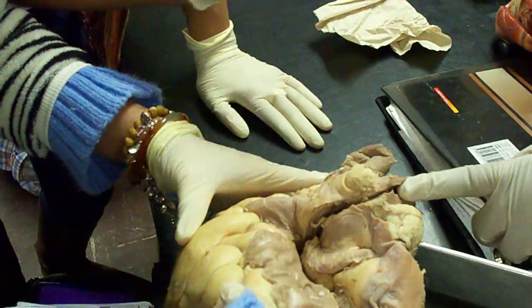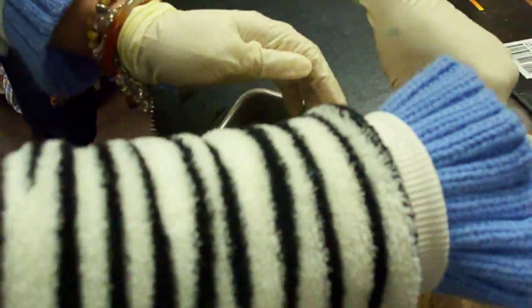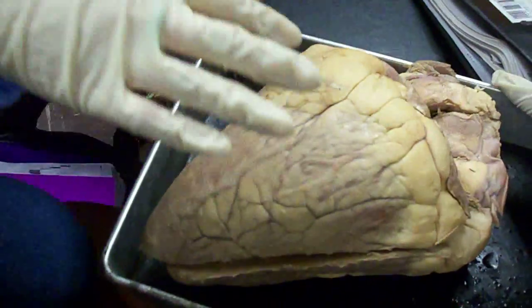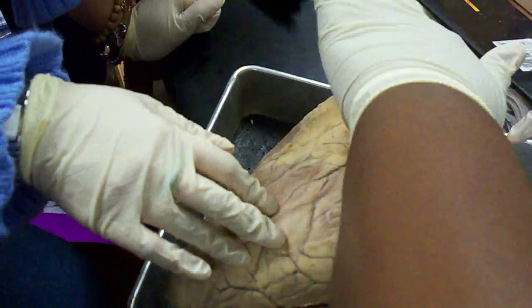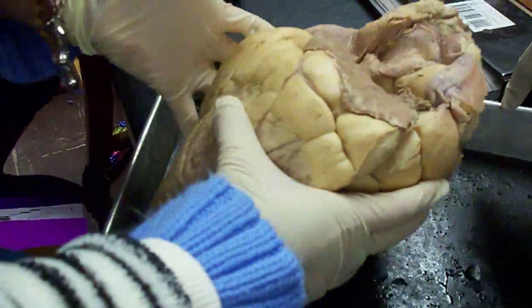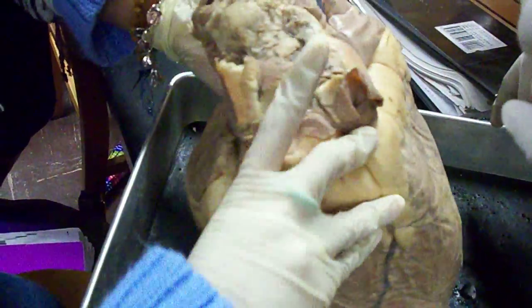Because it's supposed to be... No, that's pulmonary trunk. So where is the brachiocephalic? Wait, what is this then? Pulmonary trunk — it's just a continuation. So that's the superior vena cava. Pulmonary trunk. Where's the aorta? It's in the back, behind the superior vena cava. It's probably this one.